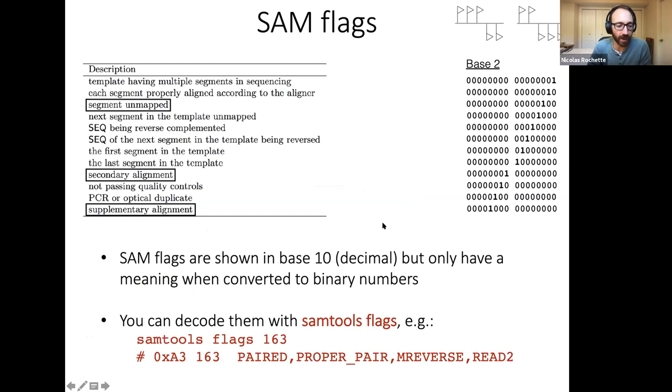And so the last thing about the BAM format is a field that's quite important when you're trying to do statistics on your alignments, and that's the flags field. And the flag field is a bit weird. These files were created in the beginning of bioinformatics, of large scale genomics, and they really correspond to binary objects. So the flags refer to, okay, I have one byte, and one byte is going to have 8 bits. And these bits can be either up or down, so zeros or ones. And each flag is going to correspond to a specific property the alignment has.